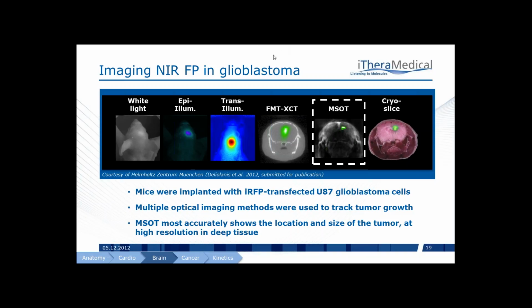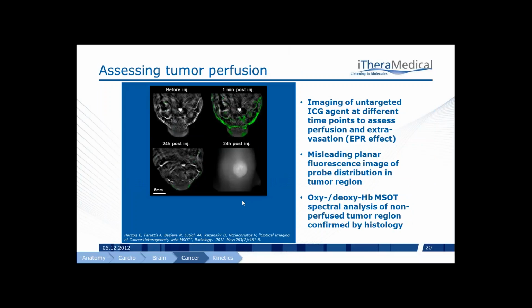Thank you, Neil. Yes, indeed, I will finish up this presentation by telling a little bit about how MSOT can be useful in cancer research and research of kinetic processes. In this first example, we show you how we can use MSOT to assess tumor perfusion.